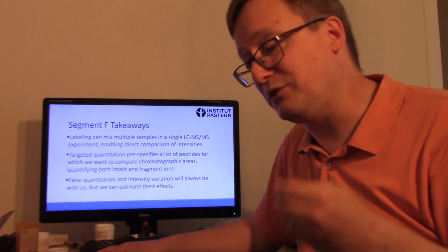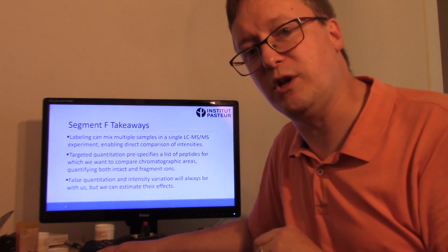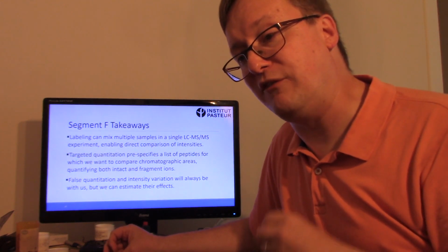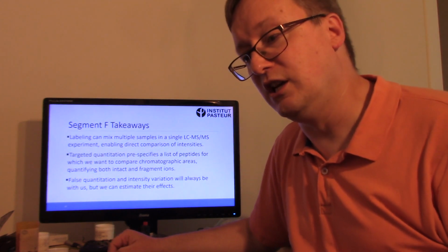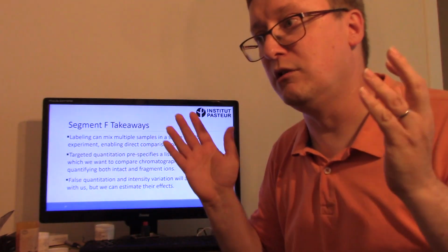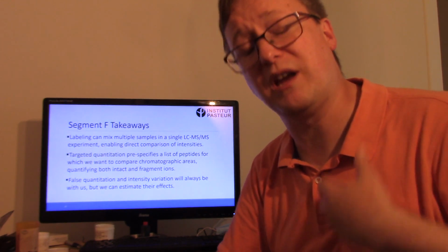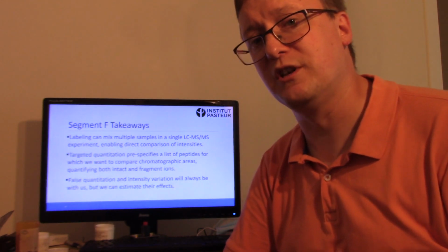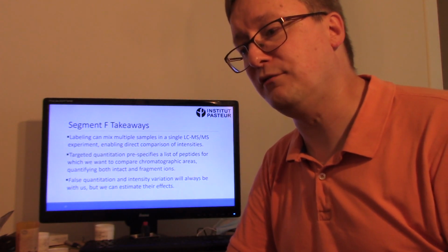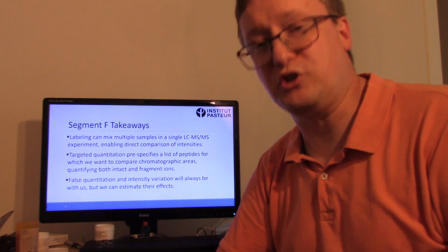If you're able to say only these proteins from this particular pathway are of particular interest to me, then you can design a targeted quantitation experiment that will give you much lower variability in measurement than what you would expect if you did quantitation from a standard shotgun experiment. So I would really encourage people to make greater use of targeted quantitation experiments to improve their research. It really does have a lot of credibility in measurement to offer above and beyond what a simple shotgun experiment can do.